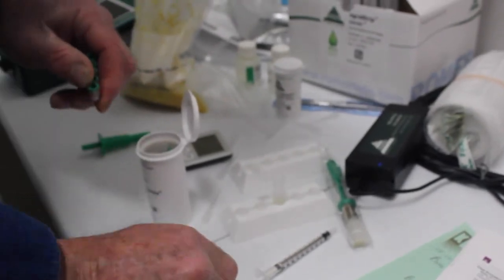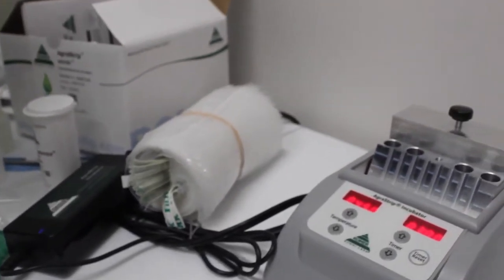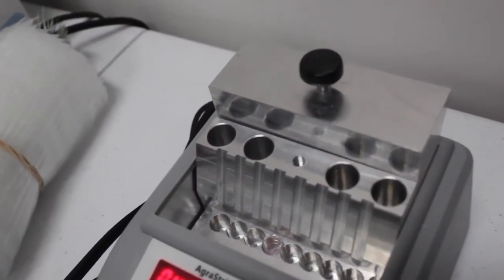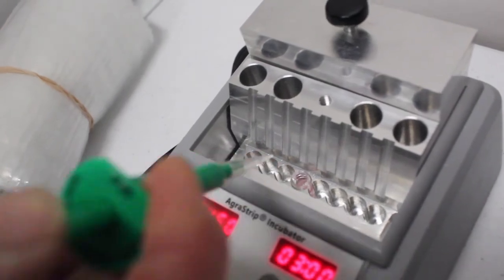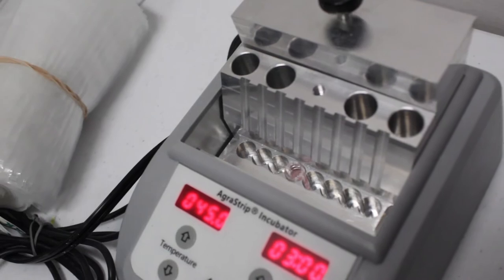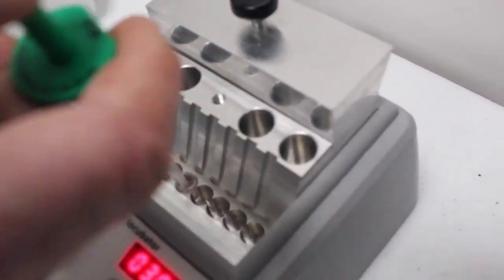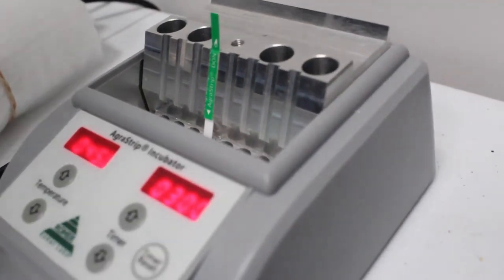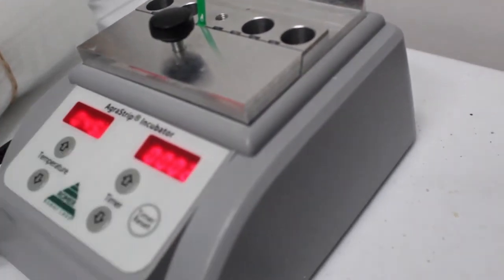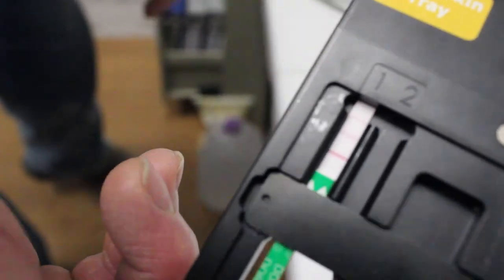Now we have a solution that's ready for testing. A microcell container is placed in the incubation chamber. Then we take 100 microliters of the previous solution and add it into the microcell. This solution is mixed with another chemical to produce a chemical reaction. A test strip is added to the incubation chamber, the chamber is closed, and it incubates for three minutes.